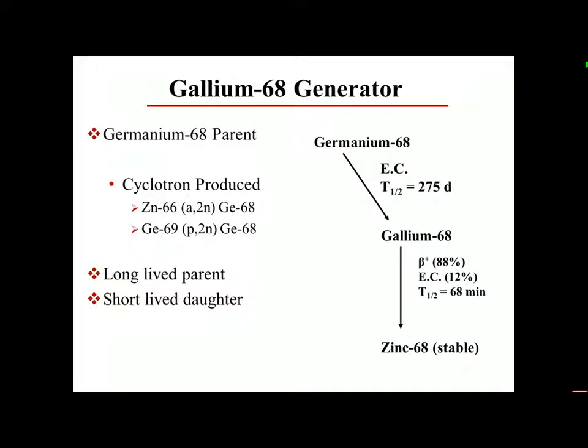Gallium generator, it's like the technetium generator in some ways, and in others it's not. Essentially, it provides gallium-68. It's eluted, but the problem with that generator is it's eluted in hydrochloric acid, so you can't just inject that final product. It has to be essentially purified and then added to possibly a kit formulation.